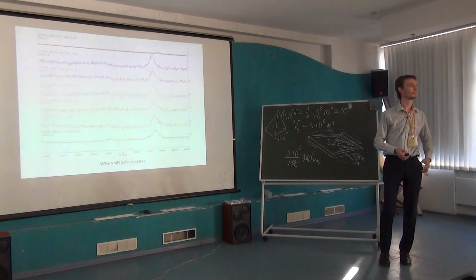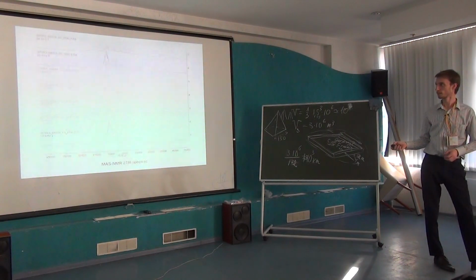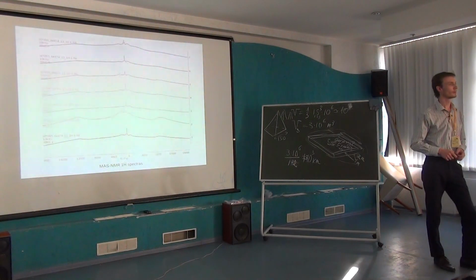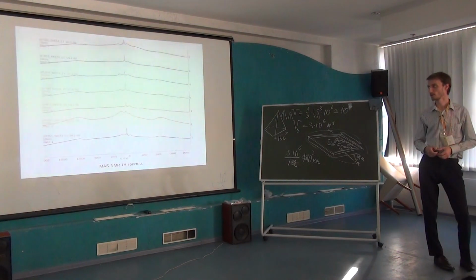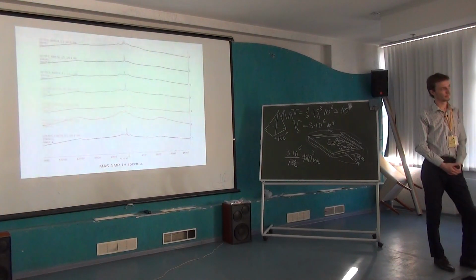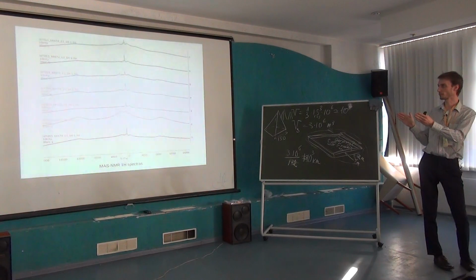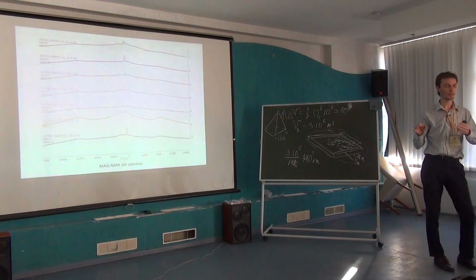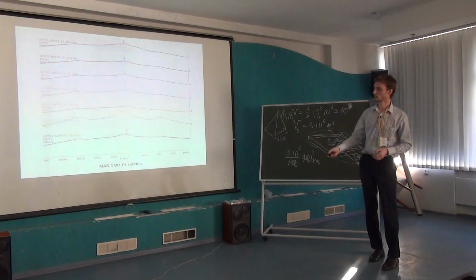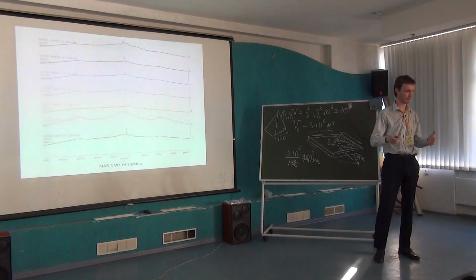Sorry, I will go. I have one question concerning your broader spectra. You did MAS spectra, of course, to narrow the lines. But we have a very, very broad line there, superimposed over the narrow lines of the water. And this background is very different on all these. Do you have an idea where this comes from? It's not the whole spectra, it's on the central piece. It also has a big plateau.